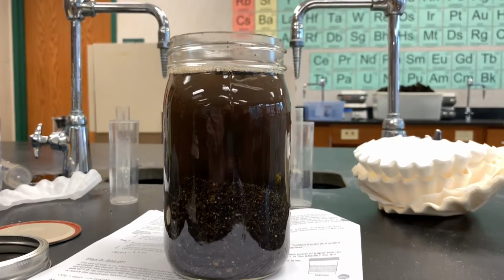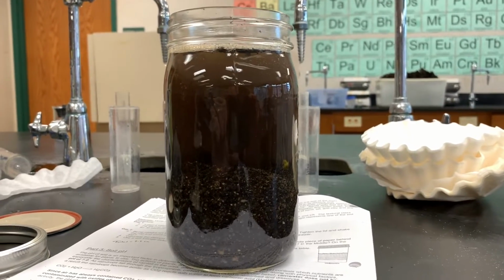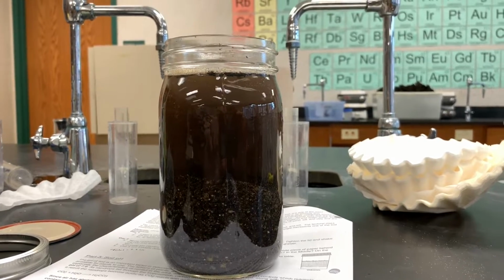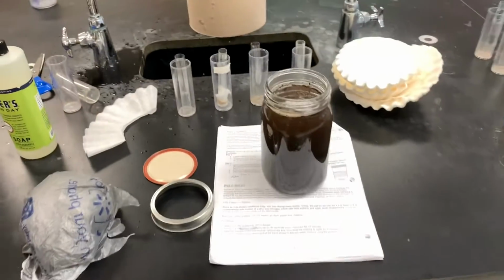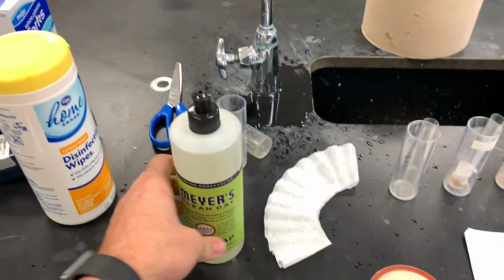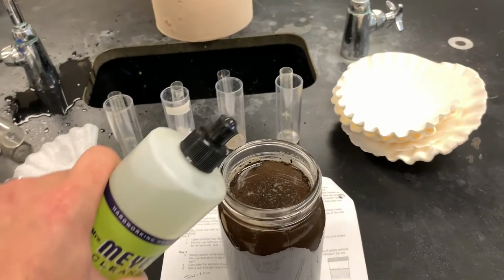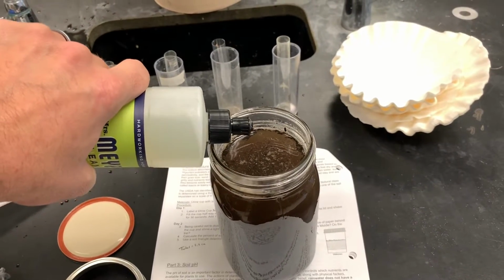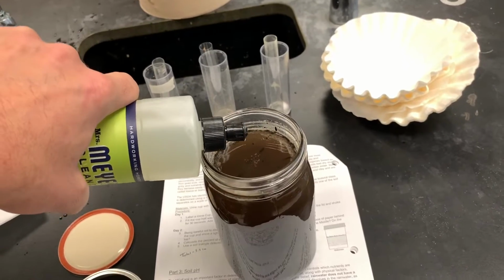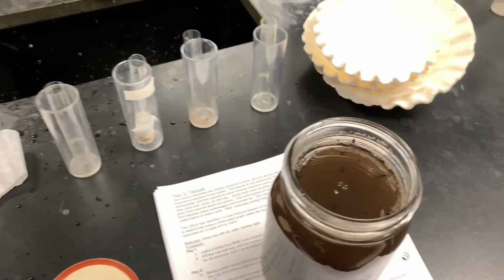You'll notice here that I have filled it up with water, not quite up to the top. You can leave a little bit of room, otherwise it'll just sort of spill over. But we want to fill it up with water, and then we're going to add one more ingredient. Just a little bit of dish soap. This is special dish soap here. I mean, you could buy it, but basically it doesn't produce a ton of bubbles. So you're just going to put a little bit of dish soap in, and what this does is it makes the settling process a little bit easier.